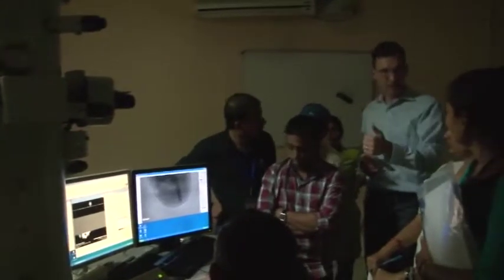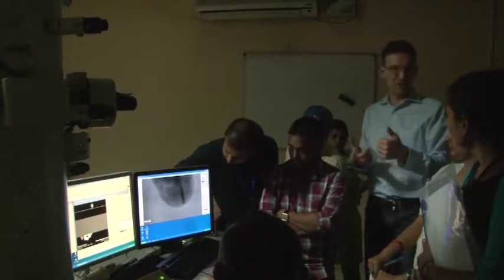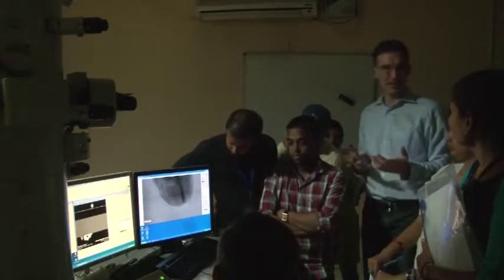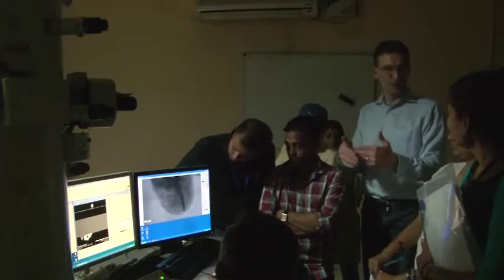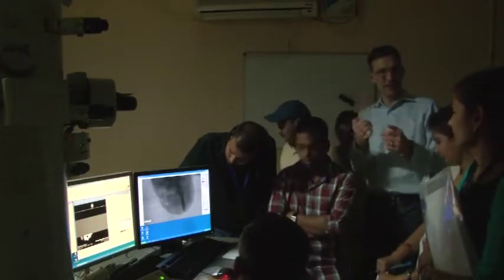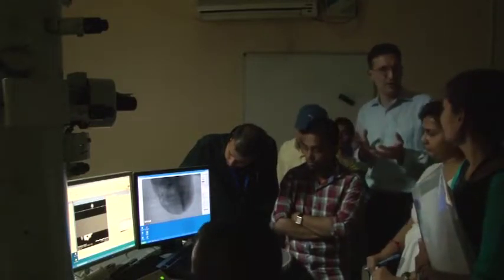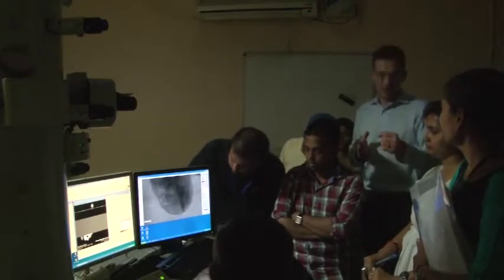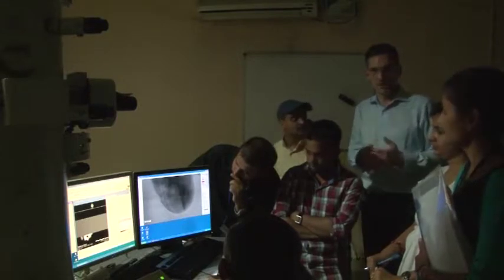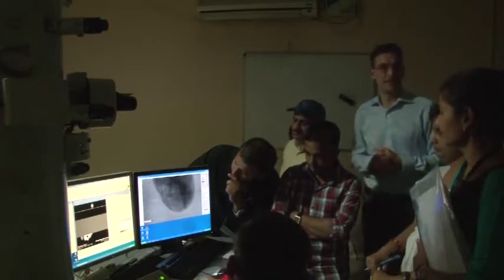You observe the lattice planes where the G vector is perpendicular. So the contributions that you get in the diffraction pattern are the lattice planes of the same crystallite that you should see in your atomic resolution image. You just select another plane, diffraction plane, image plane, and for atomic resolution you just increase the magnification. Between bright field imaging with an aperture, and taking the aperture out and going up in magnification, there's no difference. There's no specific mode, meaning that it's the same lattice planes.